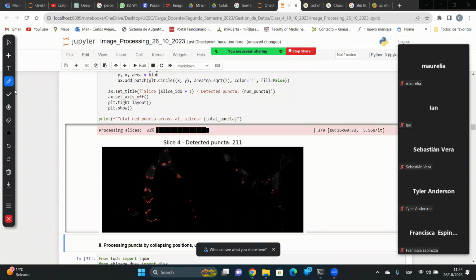Oh, this should be a different color. Just put big puncta. Here, it's a rounded circle. You have another one down there, but sometimes it's different. It's not just a single dot. Sometimes the puncta is very big. So this is a good method to distinguish that, okay?